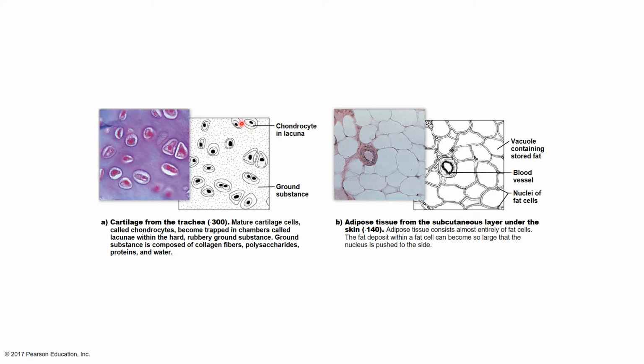Here's a chondrocyte. The way I always remember this, and my suggestion to you is you remember it because it will be on the quiz, is they look kind of like eyeballs. They give the impression of eyeballs. That's the only one that looks like this.